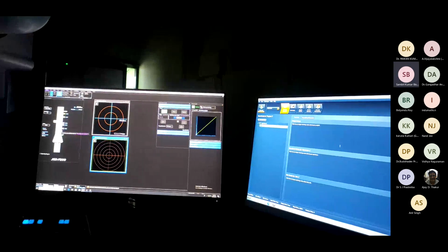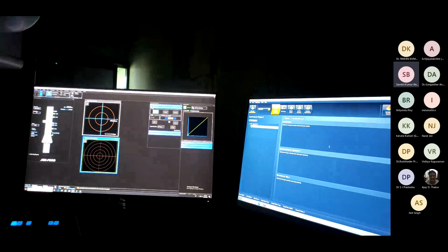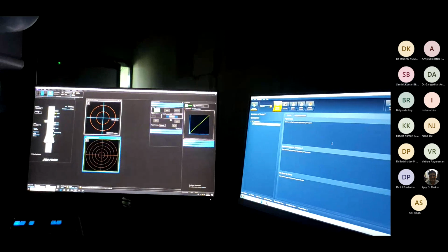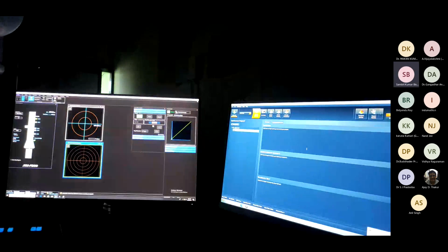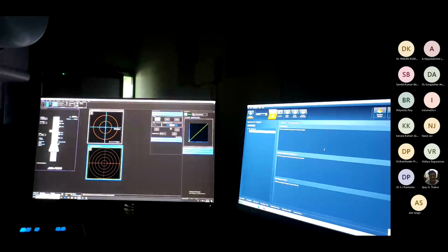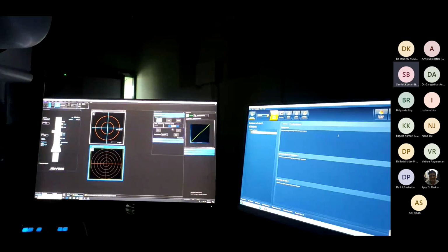What do I have to insert now? I'm not getting the ronchigram image now. Please give me time, sorry for that. Go to the next one. This one now. Image should come. This one is coming.